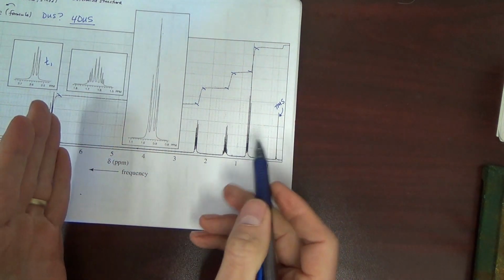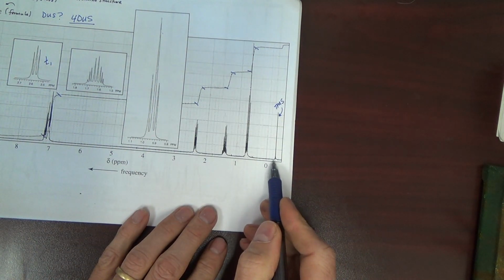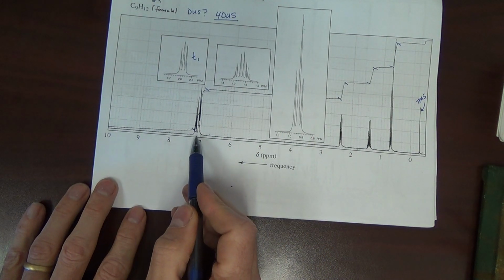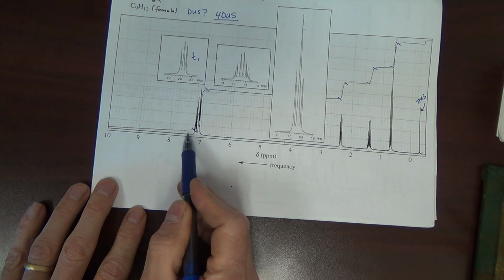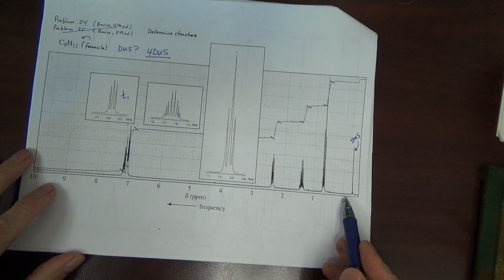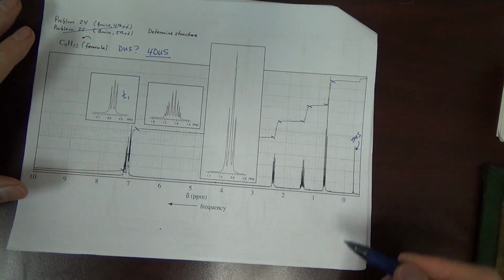That means really every peak should be moved down. That's about 1/4 of a ppm. So instead of this being like 7.1, it should really be about 7.4. Okay? The baseline has not been set exactly here. That's a little bit odd, but I wanted to point that out.